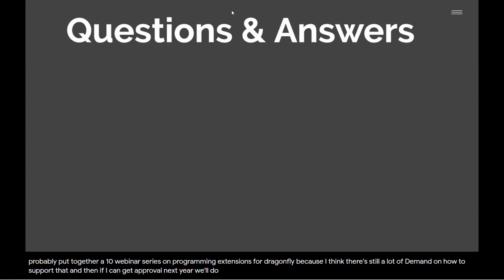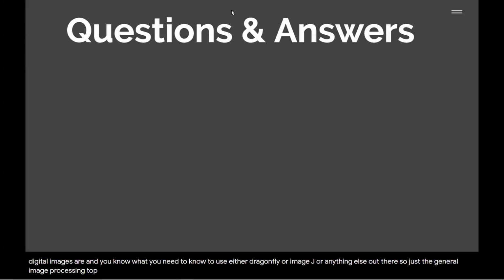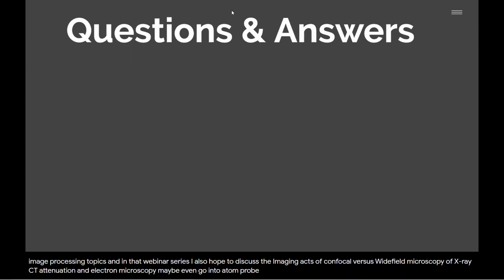And then, if I can get approval, next year we'll do an image processing for scientific imaging series, which is everything about what digital images are and what you need to know to use either Dragonfly or ImageJ or anything else out there. So just the general image processing topics. And in that webinar series, I also hope to discuss the imaging physics of confocal versus wide field microscopy, of X-ray CT attenuation and electron microscopy, maybe even go into atom probe tomography or EBSD and EDS.